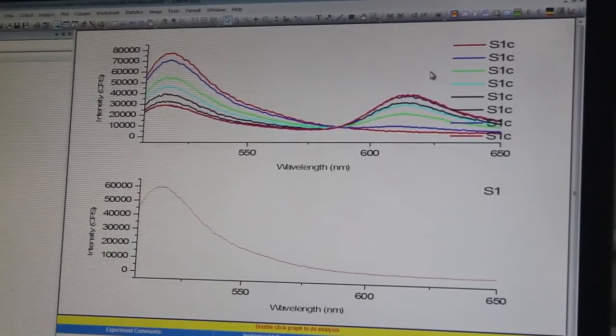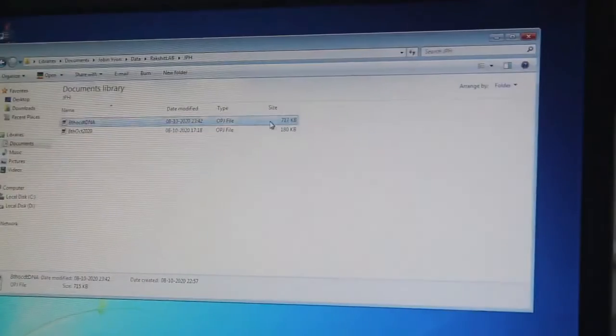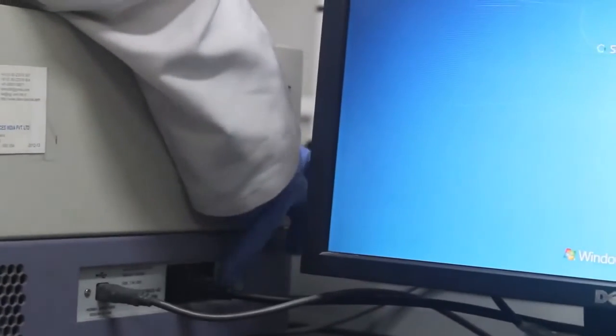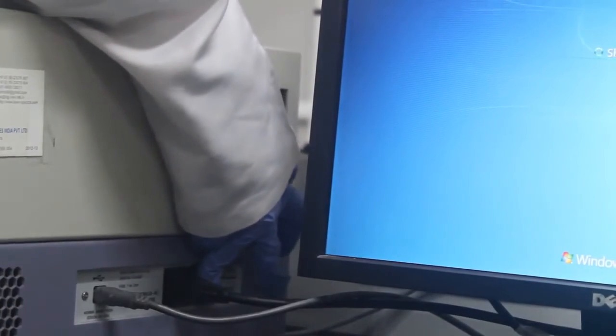We are going to switch off the instrument. First you turn off the software. After the software is turned off, you turn off the computer, and then you turn off the main switch of the spectrofluorimeter.